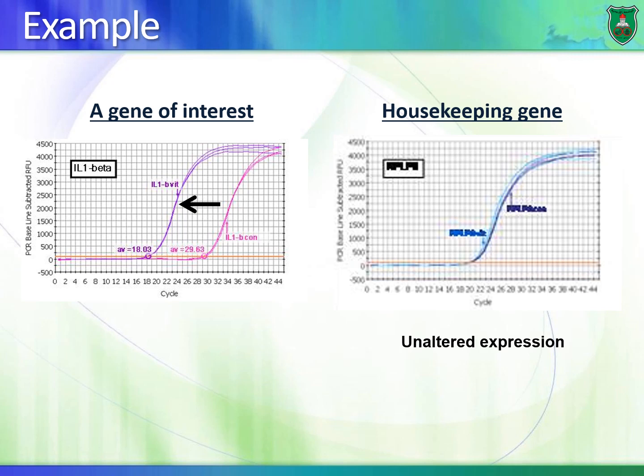So we talked about these housekeeping genes, and I said that we have to use them to make sure, like in Northern blotting, that the amount of starting material that I'm using for different samples would be the same in terms of expression of housekeeping genes, right? Why? Because it should not change. And that gives me sort of a comfort in terms of the starting material that I'm using for samples that I want to compare to each other.